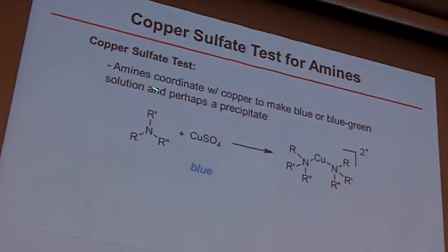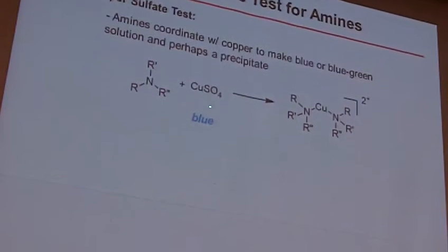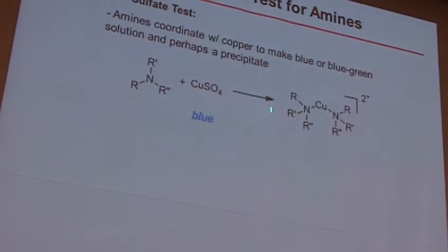And so here's how that works. Basically, you have this copper sulfate solution that's blue. You add the amine to it. You make a new complex. That's, like I said, just a different color. So it'll be blue, green. Sometimes it's going to precipitate on it. If you see that color change, that means you have an amine.